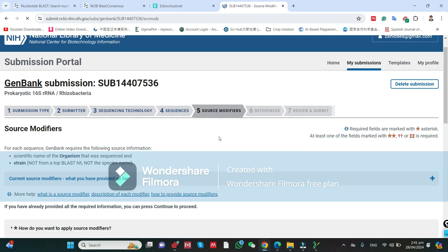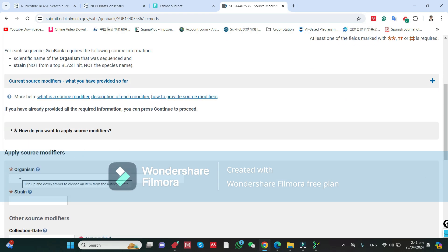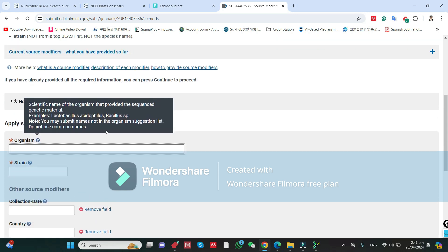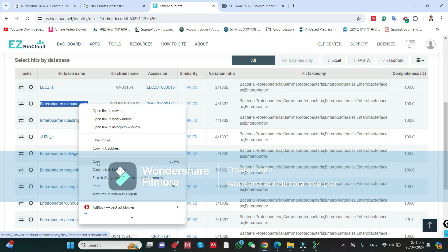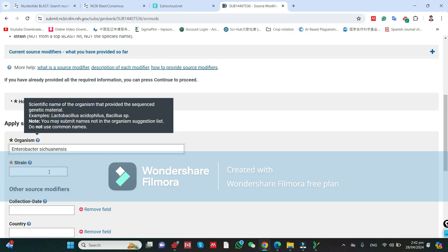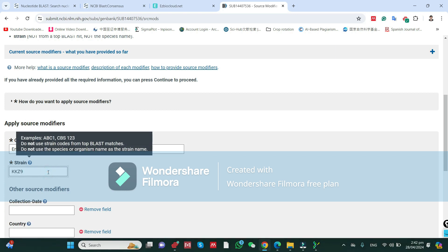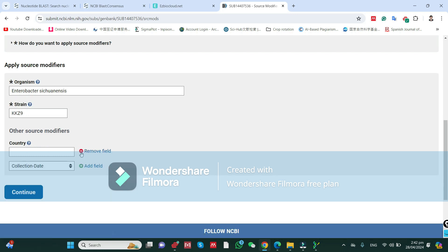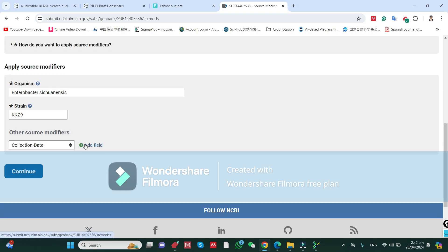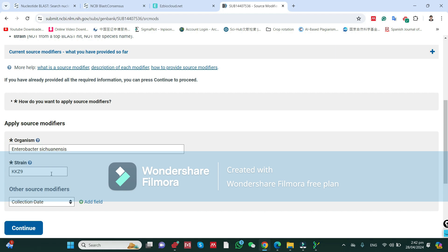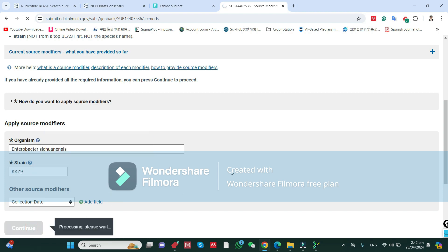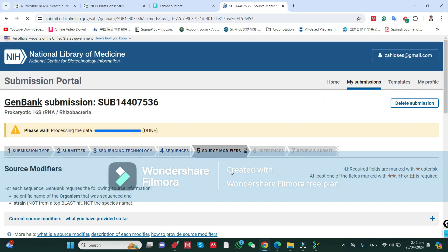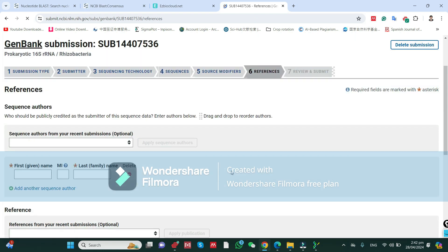Now it will ask you for Source Modifiers. The organism is a single organism — you need to write the organism name. You can also give a code for the strain collection, though this is not required. If you have multiple strains, a table will appear and you can easily enter the organism name and strain for each. Click Continue.